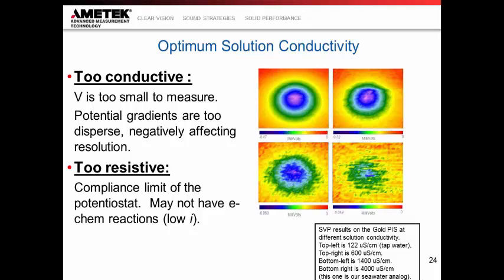Here's another component of this as well. We talk about the activity of your sample. If your sample is highly active, what can happen is it can change during the course of the experiment. So if these experiments are 1 hour long, how does that impact it? Is your sample in the same state on the last data point as it was on your first data point?